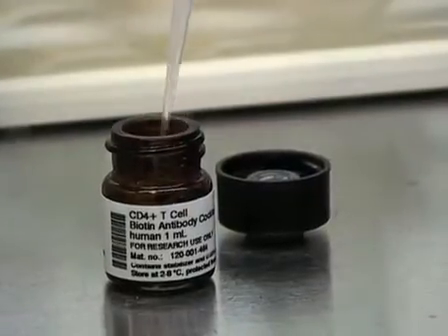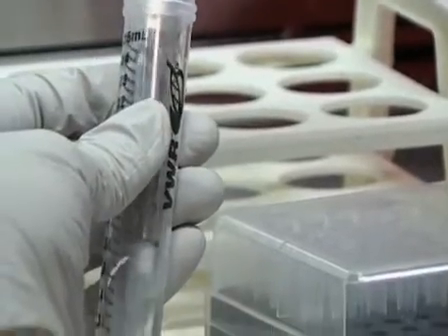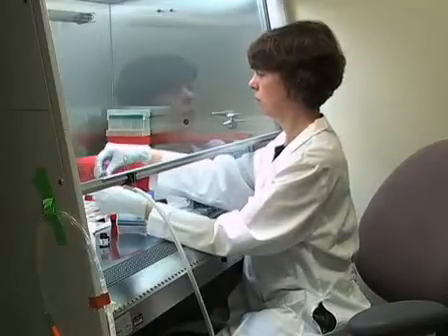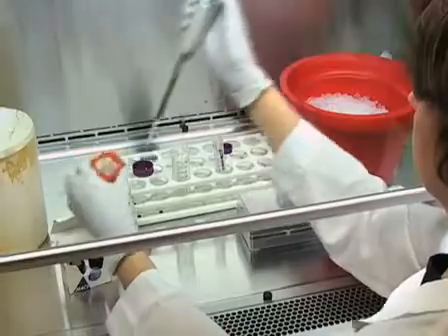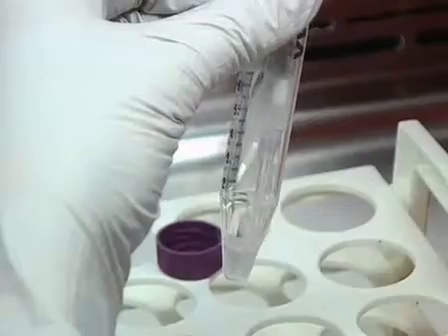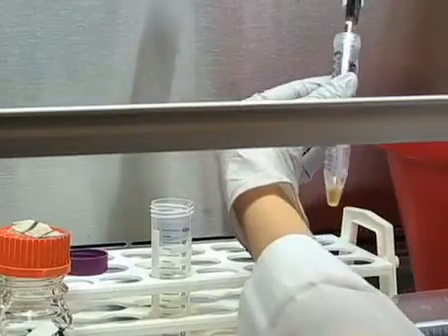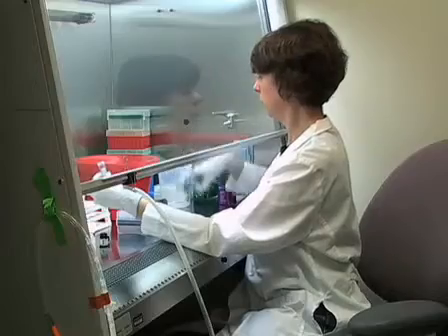Add antibody cocktail from the CD4 isolation kit, 10 microliters per 10 million cells. Cap tube and place on ice for 10 minutes. Remove tube from ice, remove cap, and add 30 microliters of running buffer per 10 million cells. Add magnetic beads from the CD4 isolation kit, 20 microliters per 10 million cells. Cap tube and place on ice for 15 minutes.